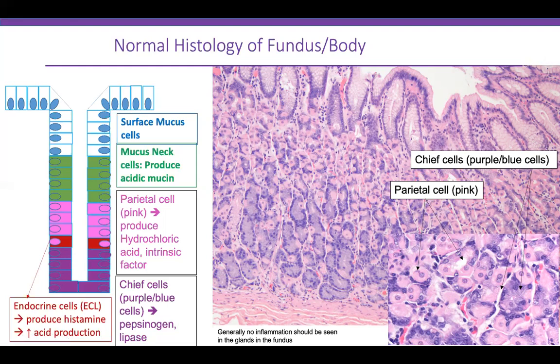There are also endocrine cells — the red cells in the fundic mucosa — which produce histamine, which in turn increases acid production. Chief cells are the purple or bluish-purple cells; they produce pepsinogen and lipase. Pepsinogen is transformed to pepsin by hydrochloric acid in the stomach and helps with protein digestion, while lipase aids digestion of lipids. In normal fundic mucosa there is minimal inflammation in the lamina propria.